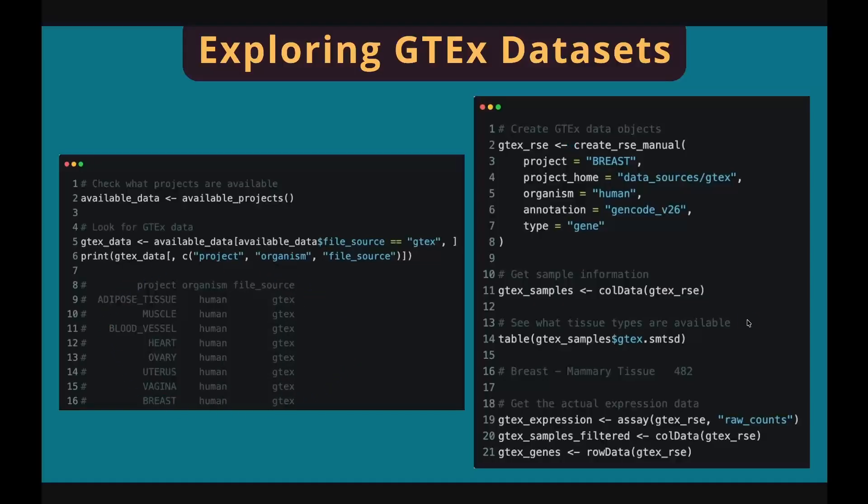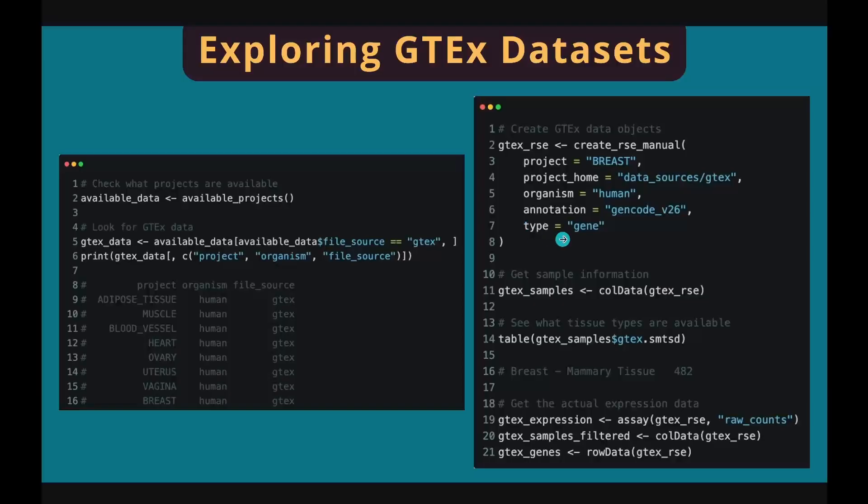Let's download gene expression data for the breast tissue as an example using createRSEmanual function. In this function, you have to specify the project name, project home, organism, annotation, and type. This function returns an R object that contains gene information, sample information, and gene expression matrix.